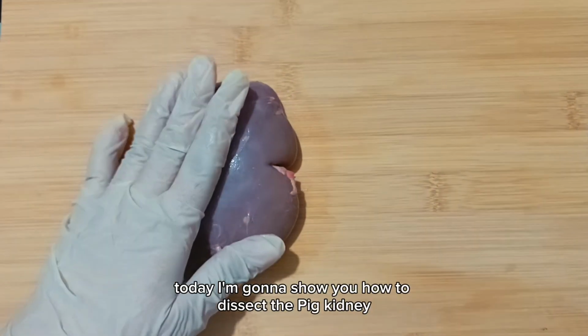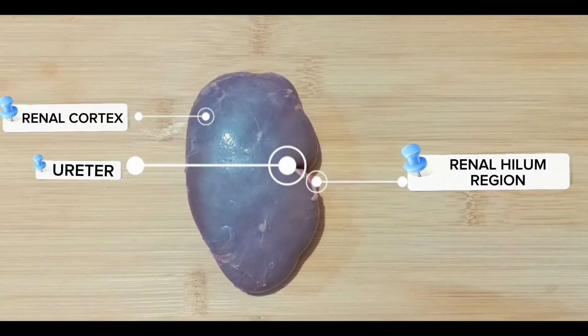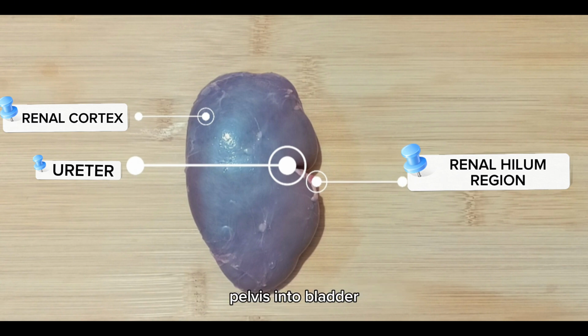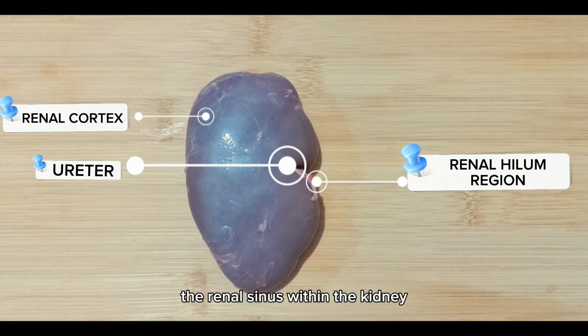Everyone, today I'm going to show you how to dissect the pig kidney. So we have here the renal cortex, where the nephron's blood filtering units begin. The ureter transports urine from the renal pelvis into the bladder. The renal hilum region leads to a large cavity called the renal sinus within the kidney.